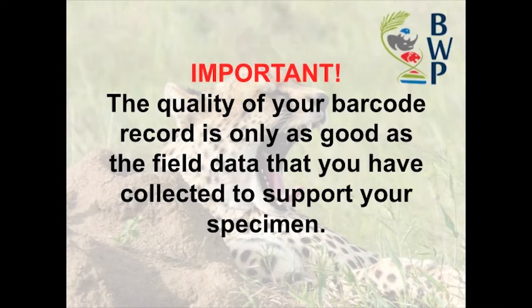The second point is that the key to successfully creating high-quality barcode libraries depends on two things. One, capturing high-quality relevant data either in the field or when subsampling repository specimens, and two, the correct storage of the material in a way that is traceable, permits little or no user error, and allows high-quality data to be reproduced if and when necessary.